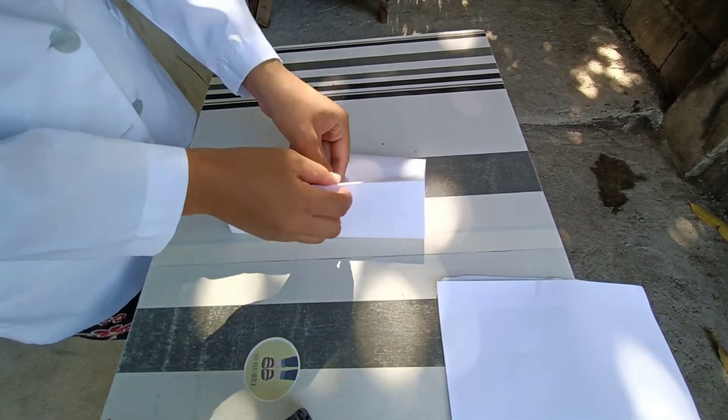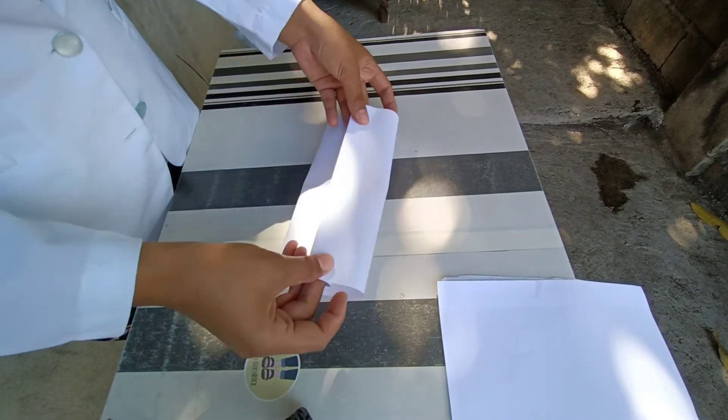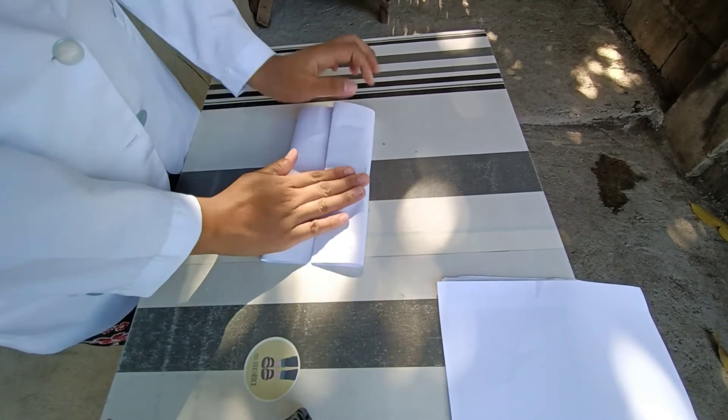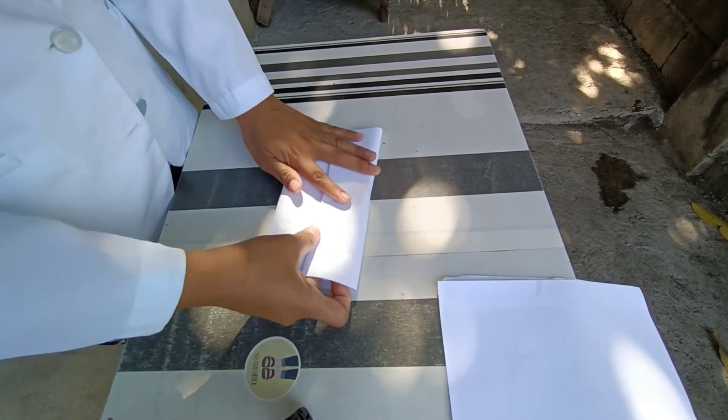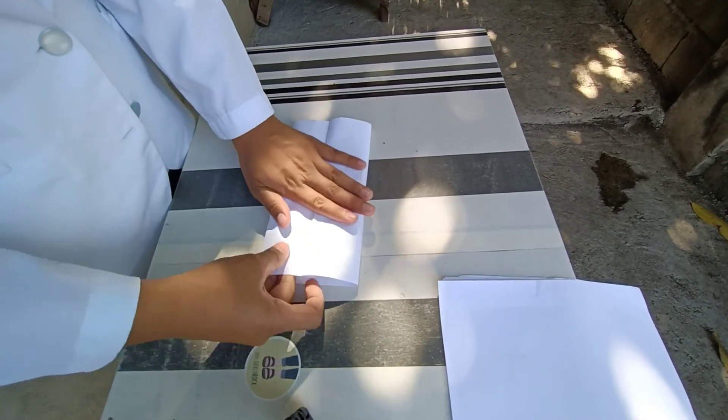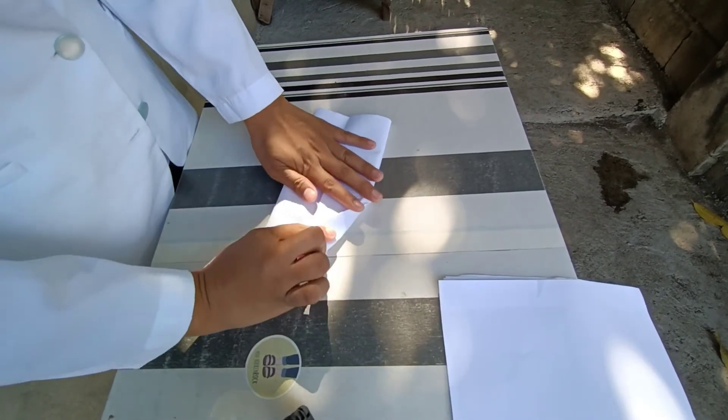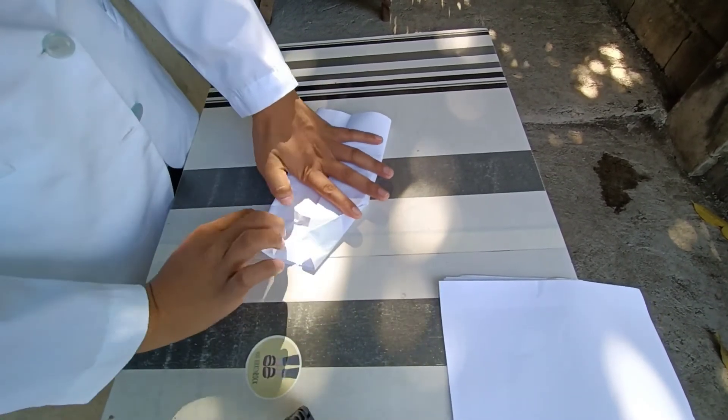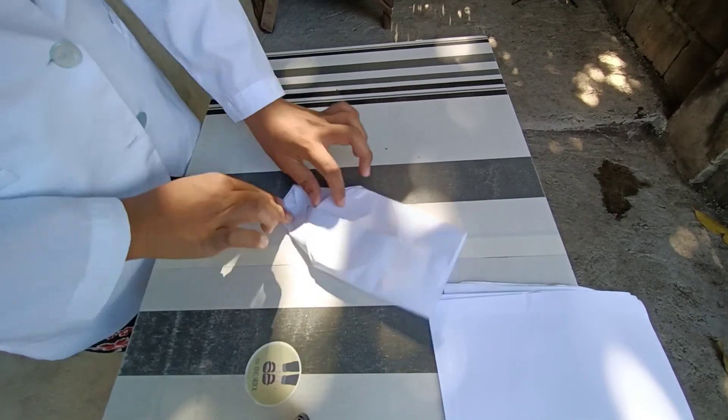We now grab both ends towards the center to meet, overlapping each other. Then pull it to tighten. Now fold like this, both sides, and also from the other side.